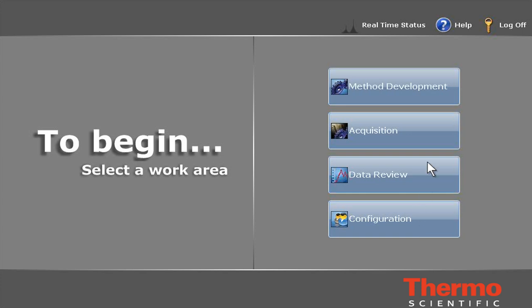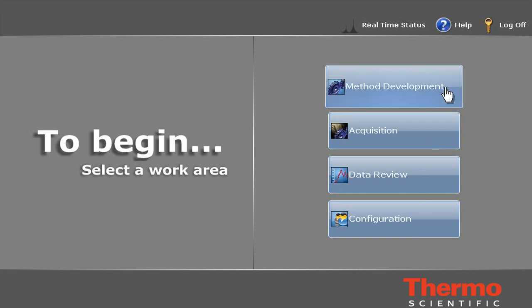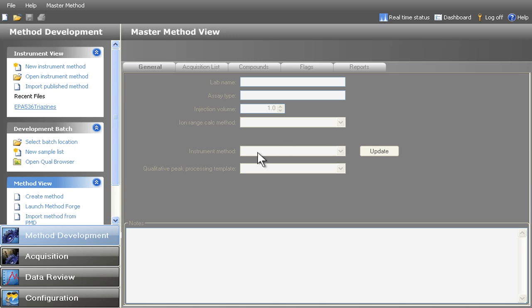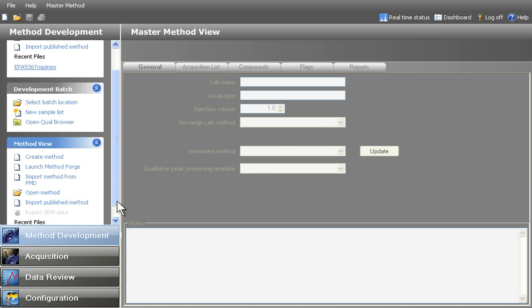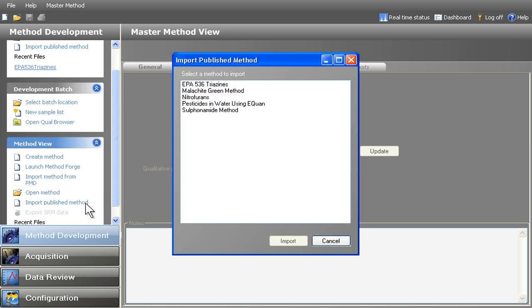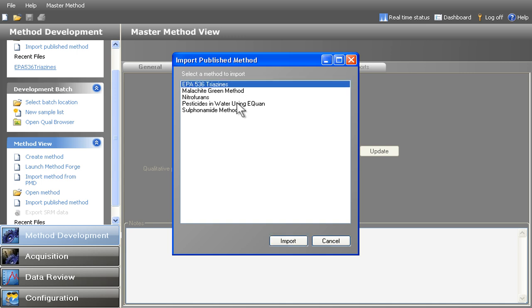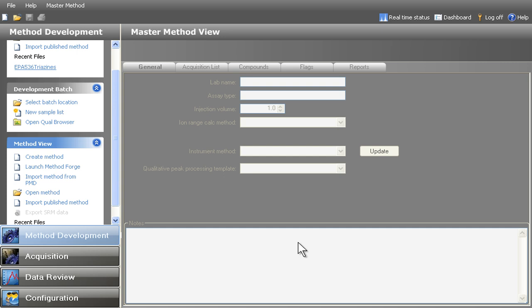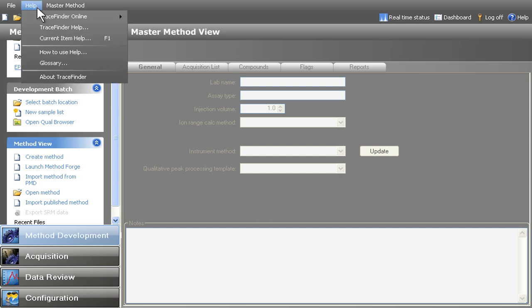To facilitate faster method development, TraceFinder incorporates a comprehensive list of published methods for food analysis and water testing, enabling users to quickly select or develop the method of their choice. In addition, users can download newer methods from the Thermo Scientific TraceFinder website.